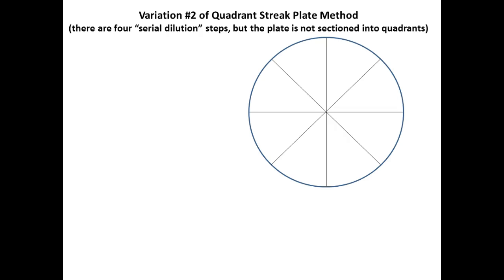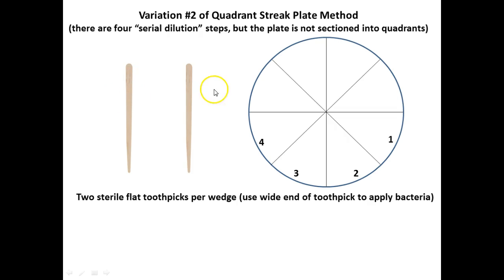Yeah. Worked in a lab where he had to do a lot of samples. So can you imagine having to do 8 Petri dishes? So instead, he would actually divide a Petri dish into 8 sections and do tiny little streaks in each section. So he'd use sterile toothpicks, right? And he'd use the end of each of the sterile toothpicks.